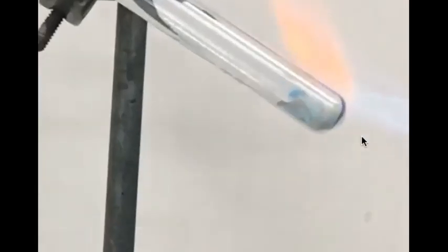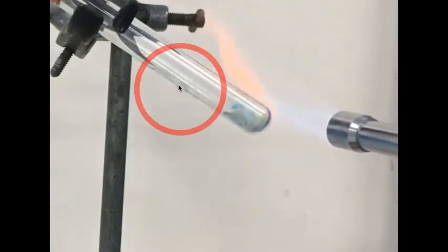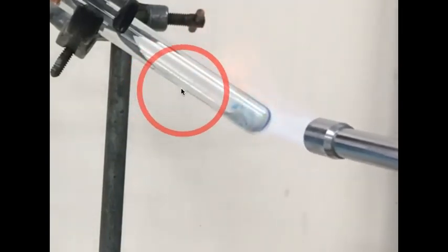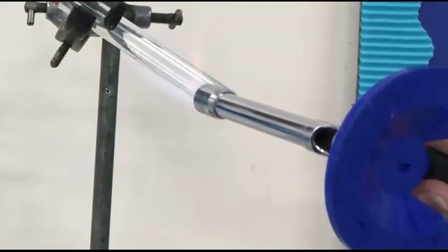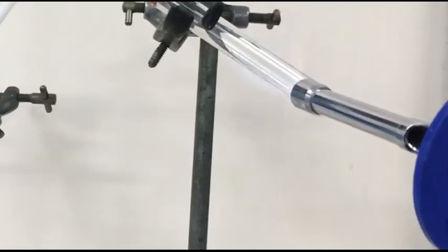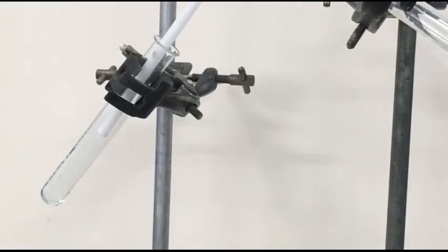As we drive off the water, you can see that there is some water vapor here, and that water vapor is going up the tube and it is coming down here and it is collecting in the delivery tube at the bottom. And that is why the color change is taking place.